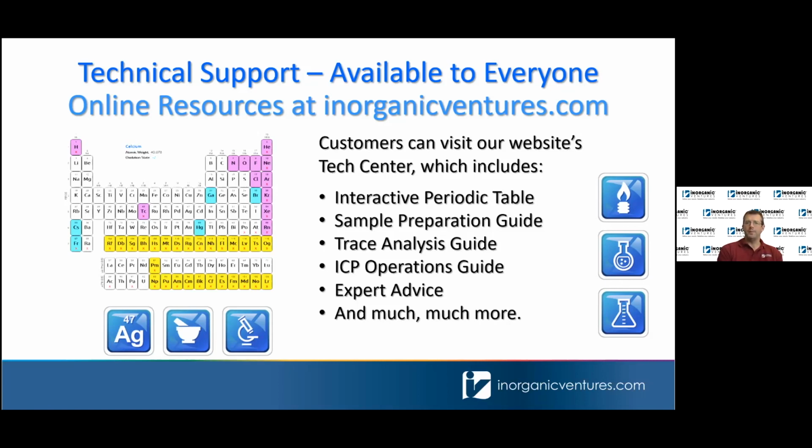Thank you. Yeah, mercury is getting sticky because of the element itself. We have not noticed that calcium, silicon, or iron are specifically sticky elements. Generally, with nitric or HCl, your iron or calcium should wash out pretty well. Silicon's a little trickier. That one depends on your spray chamber. So if you're using silicon, chances are you're using HF, because that's really the only way to get it soluble beyond 10 ppm. If you're using an HF-resistant system and you run very high silicon, it'll stick around. It's sticking to that coating, I think, on the spray chamber, not necessarily the nebulizer.